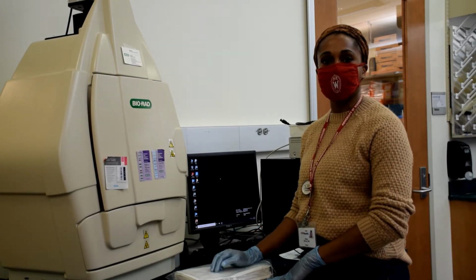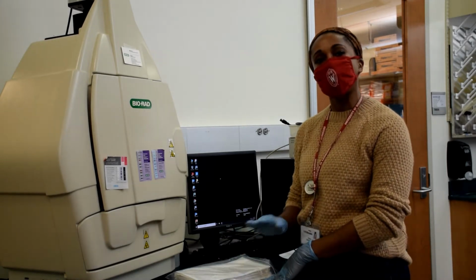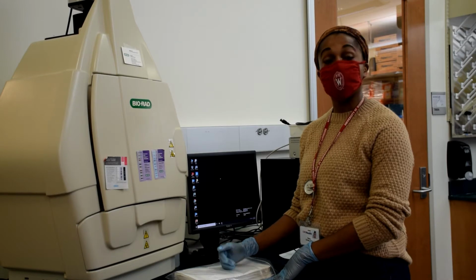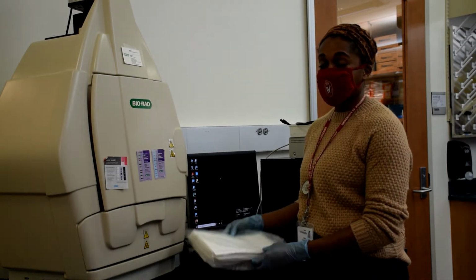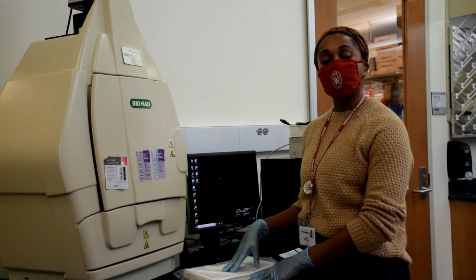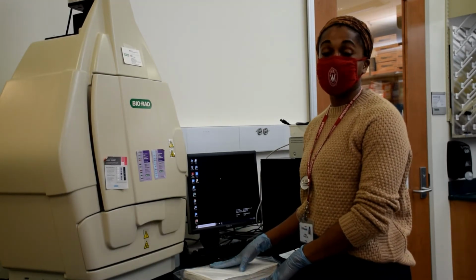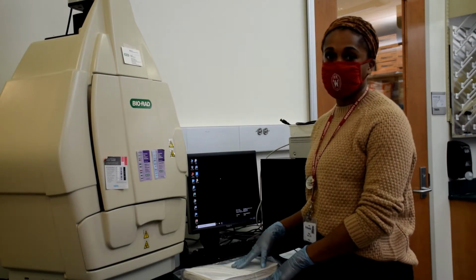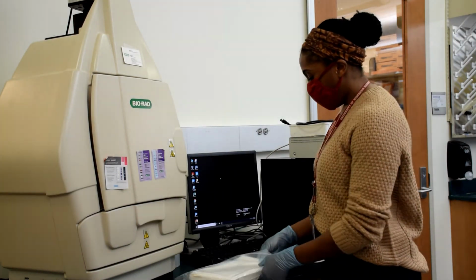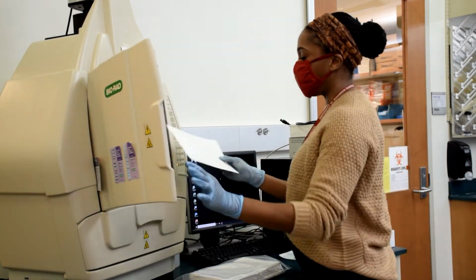So I have 2 different transgenic mouse models that I work with, also with a control mouse model, which is the wild type, which has no genetic alteration. And what we do is that we take those mice and we allow them to urinate on filter paper for about 4 hours. We collect that filter paper and we let it dry, and then we are going to image it using our imager and our software to see what those urine spots and the urine behavior of those mice are on the filter paper. So let's get started. I have a full stack here of my urine samples. So I'm going to take each and place one at a time into the imager.